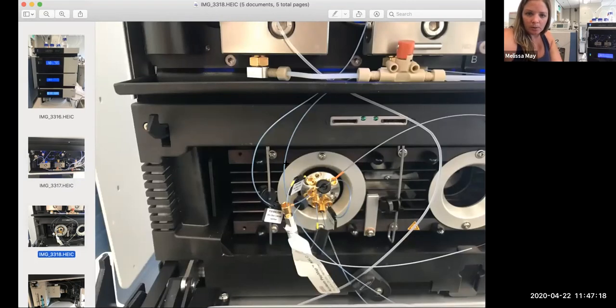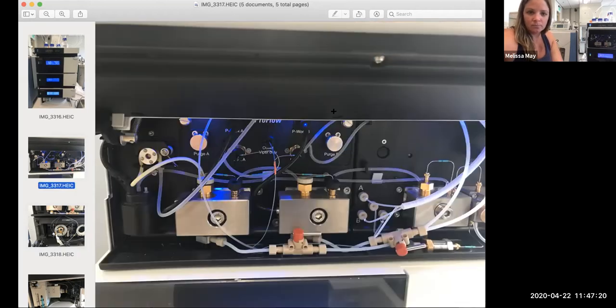And so we're taking solvent from here down to there. If you purge these blocks, you need to open these valves all the way. For the loading pump, you only need to open it like a quarter of a turn to let sufficient pressure out. If you need to calibrate the flow meter, let me turn the flow off.